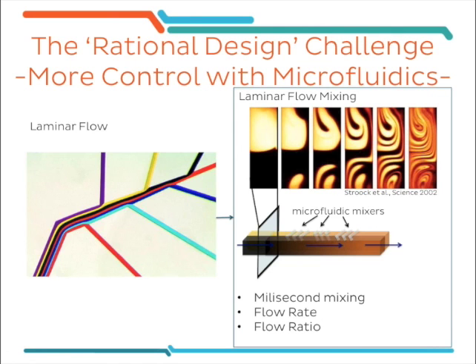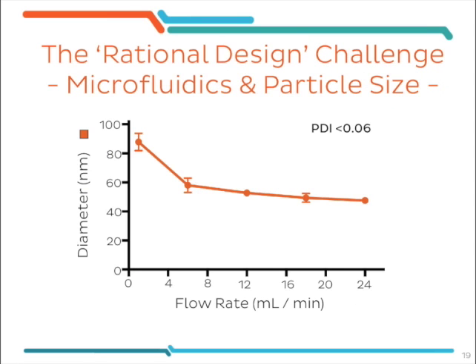And this folding over exponentially increases the interface between the two fluids while decreasing the diffusion distance. And as a result, the mixing speed is extremely fast. And here by extremely fast, I mean that we mix within millisecond range versus, if you remember what I just said before, mixing in a second range in a normal beaker. Also, since we bring the fluids together in an inline manner, the ratio of the two fluids to each other remains constant during the mixing.